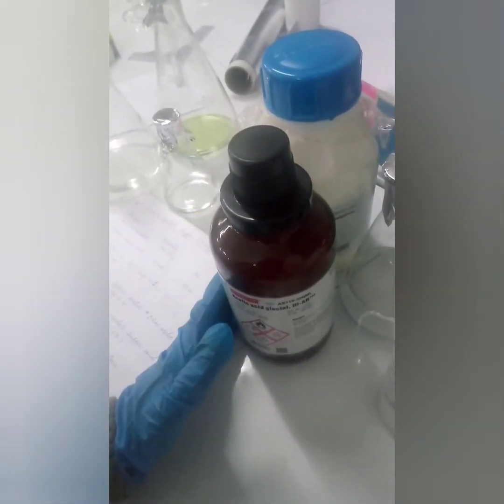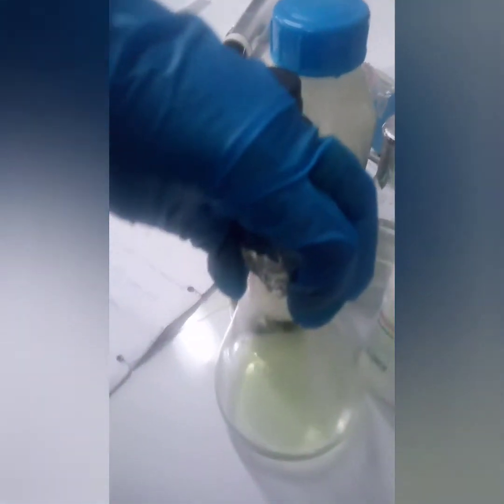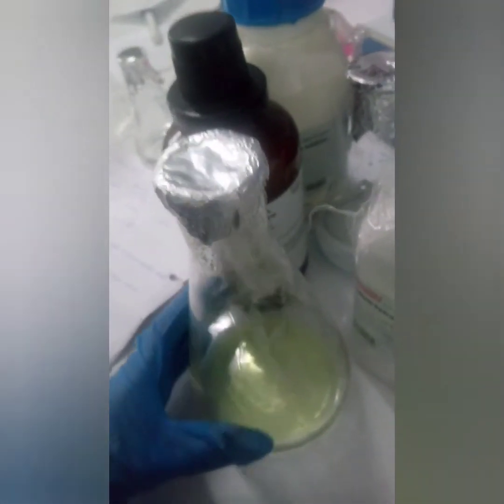After we get the pH of this buffer at 5, the next reagent that we require in this experiment is the Ninhydrin reagent. For this, first we need to prepare 8% Ninhydrin: 8 gram of Ninhydrin dissolved in 100 ml of acetone.